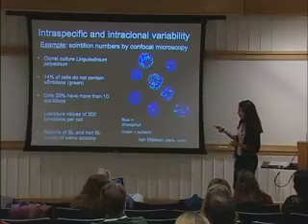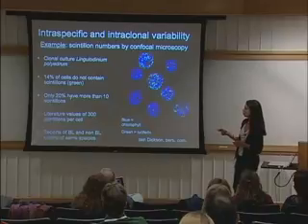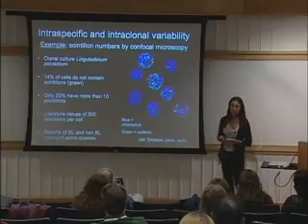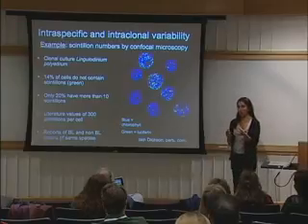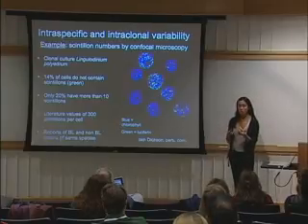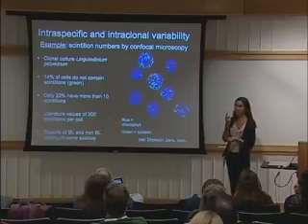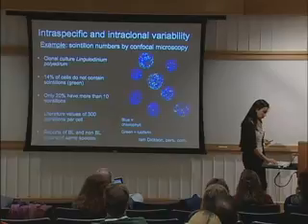In this case, I'm showing here 14% of cells that do not contain scintillons at all, and then we have 20% of them that have more than 10 scintillons, and the literature values report about 300 scintillons per cell. So within these cells we find a lot of variance. Within cultures of Emiliania huxleyi, we find different degrees of calcification. We have cells that have several layers of coccoliths and cells that have one coccolith. So there is some variability that, again, we need to take into account.